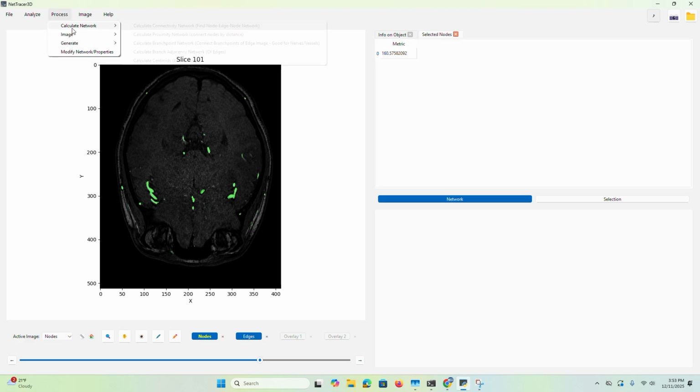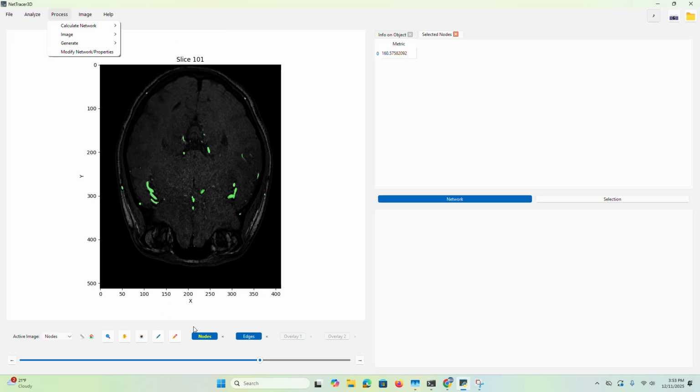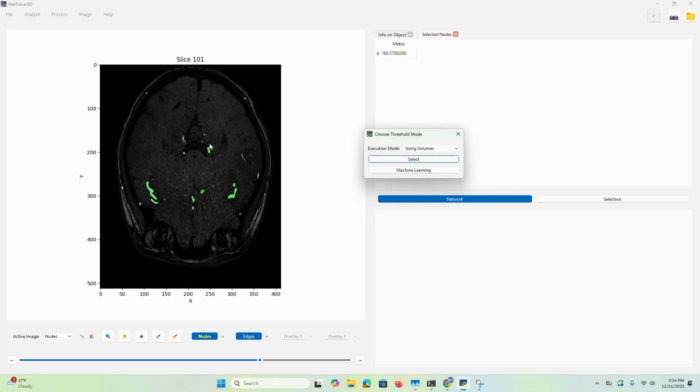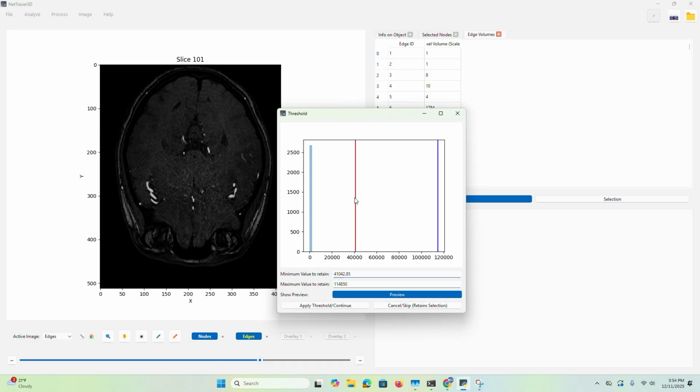You're going to want to usually do it through the image processing window. You can label your objects, which assigns them values, and then you can filter them by volume if you want, or you can just click on stuff you don't like and delete it. Make sure that it's set to the active image that you actually want to mess around with. So let me just try this here. And turn on the highlight overlay so you see what it's interacting with.